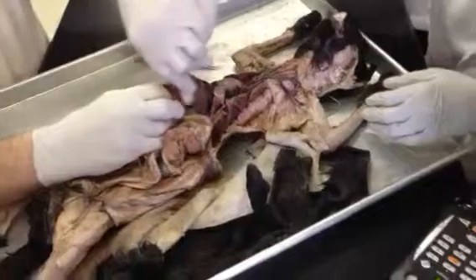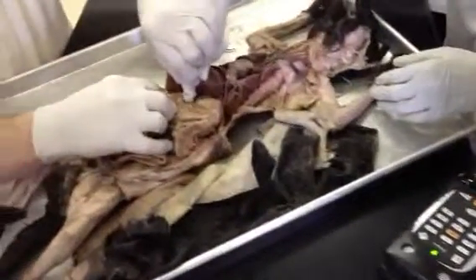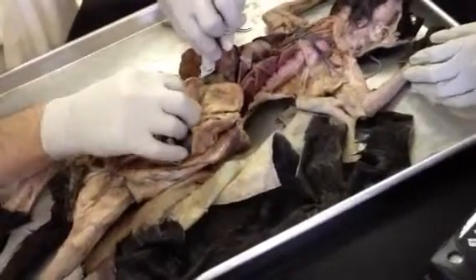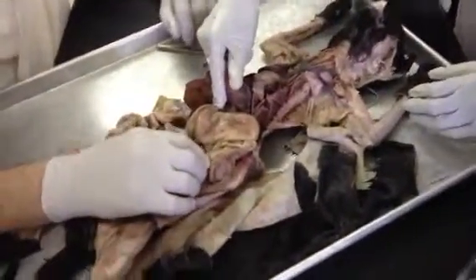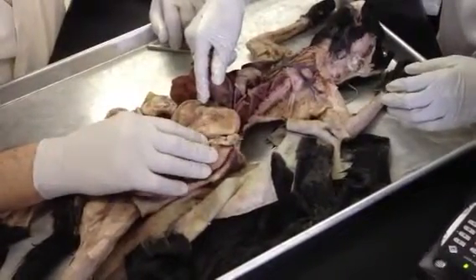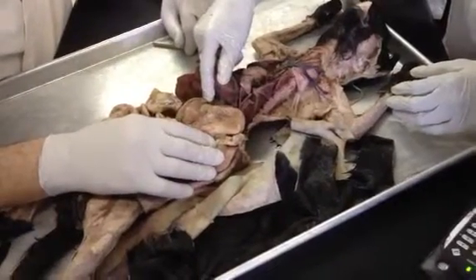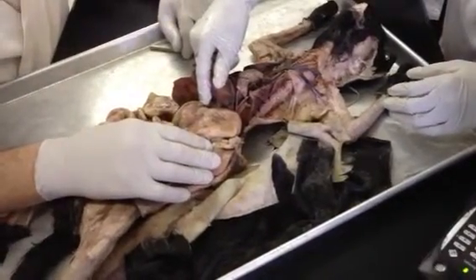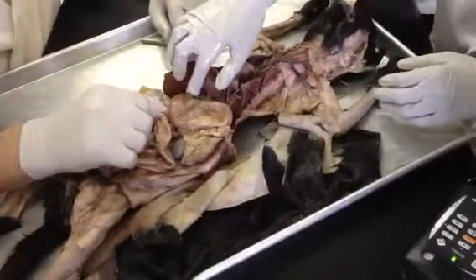So there's the liver right there. All of this is lesser omentum. All this business in here is lesser omentum. And in there is the common bile duct. That's the best I can do. What I'll do is show you the lesser omentum, and say, name the duct within this membrane. It can only be the common bile duct, because I think it's too small for you to differentiate it with your fingers. It just blends in too well.